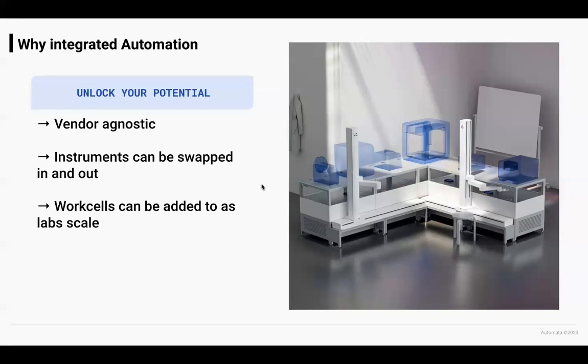So it is literally taking it off, reconfiguring your workflow, but it shouldn't require reconfiguration of everything. And then same with scaling. So again, this will be in the examples, but you can start with a small system and you can add to it, and you don't have to reconfigure your first system.